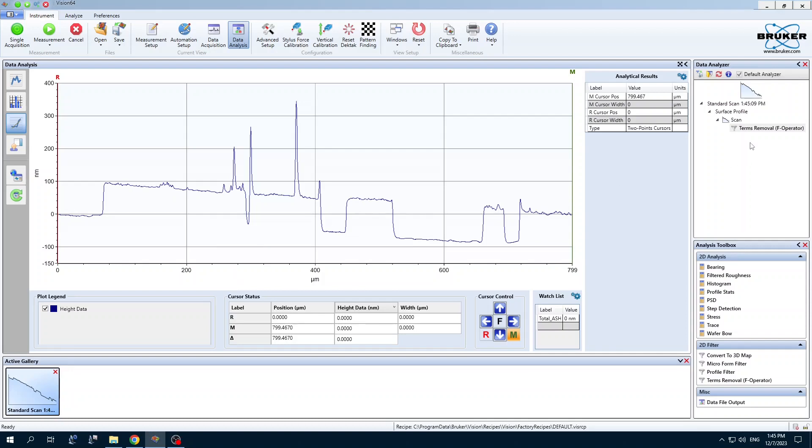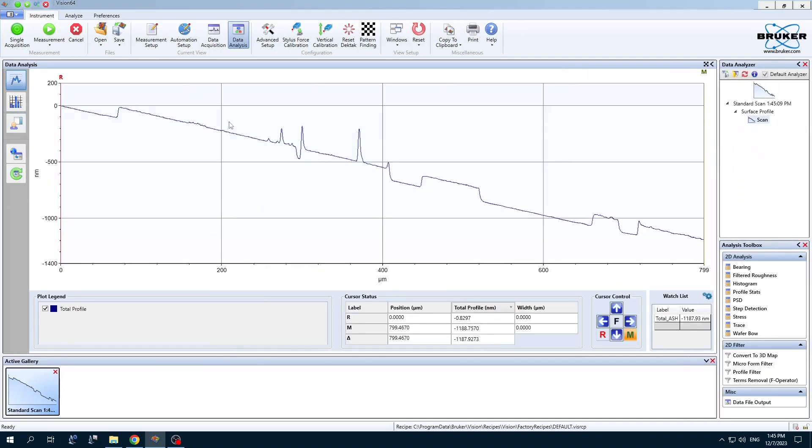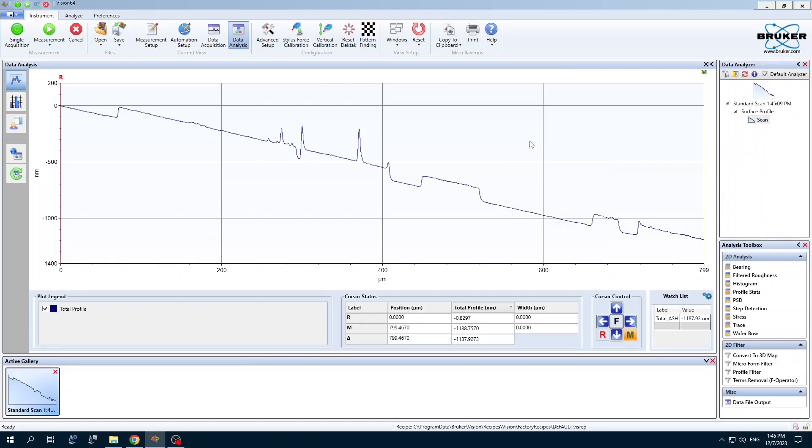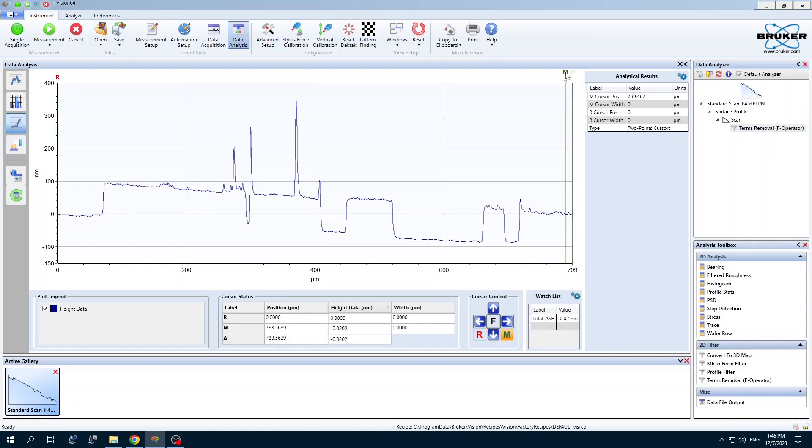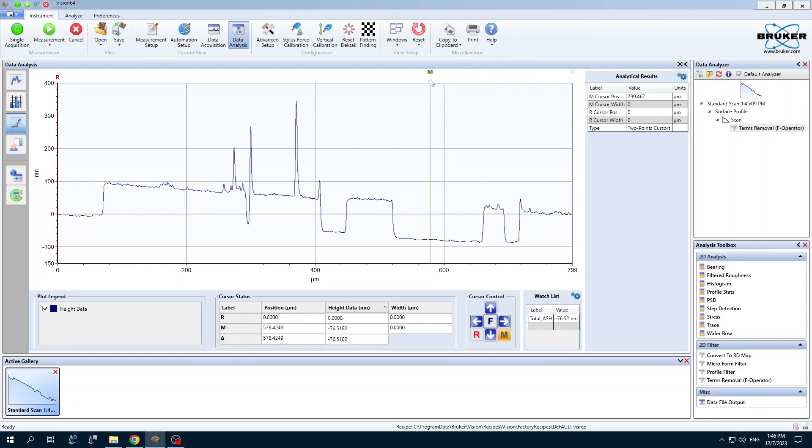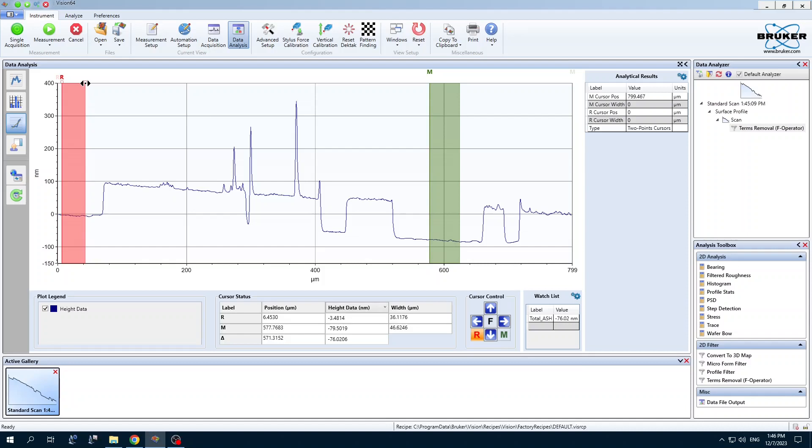First thing we want to do is to flatten the scan. For example, if this is here by default, I'm just going to delete that. This is the original data here. What we want to do is add this terms removal so we can subtract the baseline. But we don't want to use this entire sample as a baseline. Otherwise, it's going to tilt the whole thing.